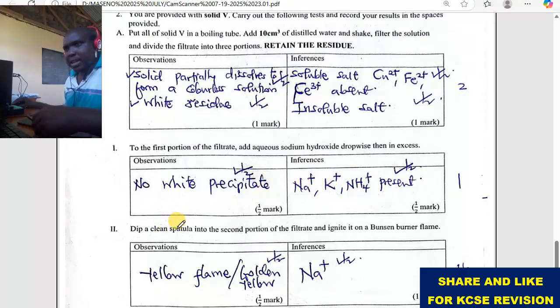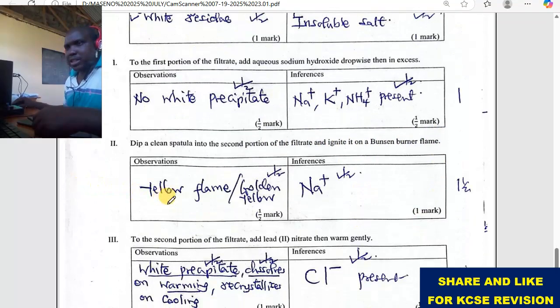That is fine. Dip a clean spatula into a portion of it and ignite it in a Bunsen burner. The observation is a yellow flame, golden yellow. For golden yellow, it means sodium ions are present.